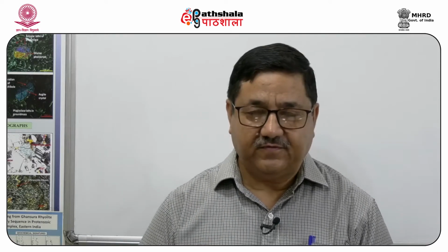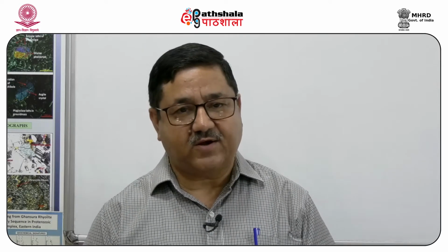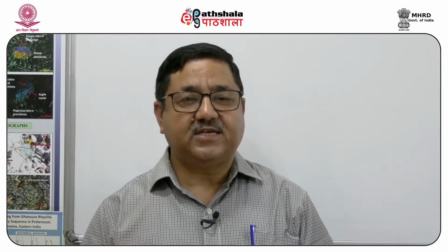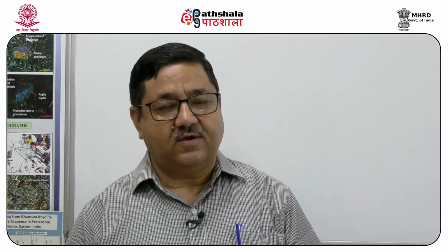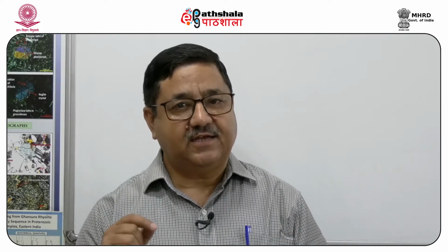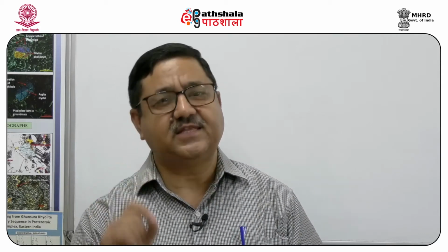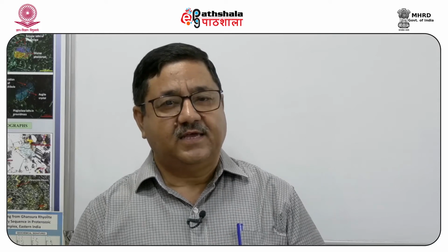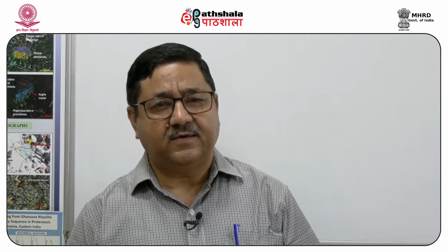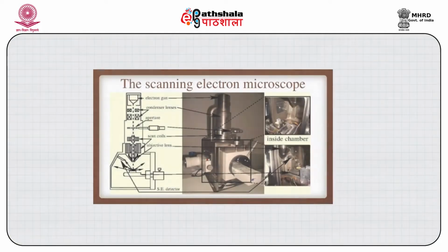Actually, the precursor of the scanning electron microscope was the transmission electron microscope, where initially physicists experimented with a thin sample. By thin sample I mean that the beam of electrons can pass through that sample, which means a very thin sample. Then in 1938 von Ardenne added a scanning coil to this transmission electron microscope, and that can be considered the original or the first scanning electron microscope.